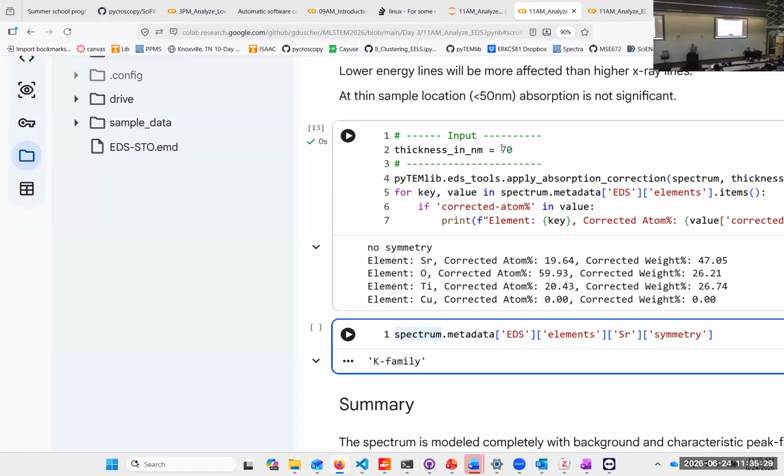Yeah, I know 70 nanometer looks better, but where do you trust it, right? So 0.5 up and down, that's where I would put it too. That's correct after absorption, exactly. But I want to caution you, it really should be done iteratively.